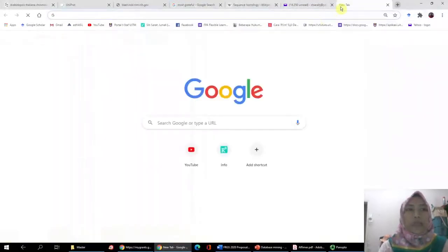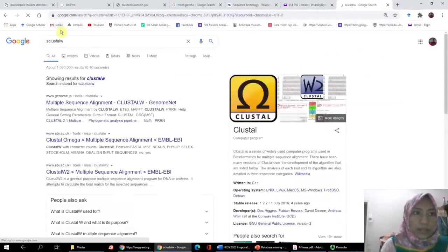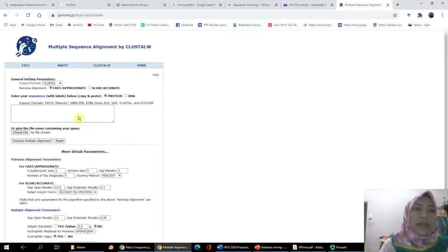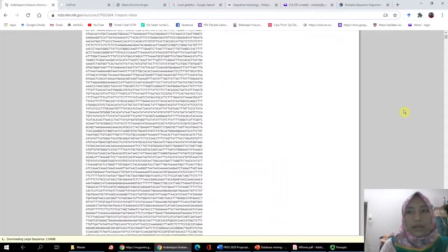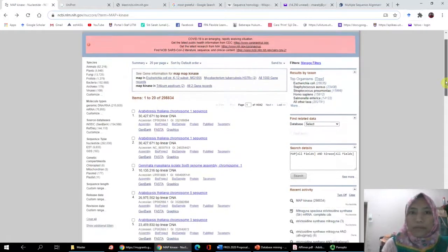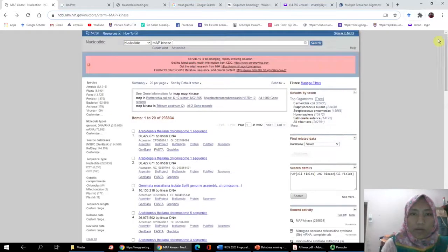And like I said, if you're looking for sequence alignment, there is ClustalW. Sorry, it's ClustalW. This is for multiple sequence alignment. Let's say you take 5 of these and just copy them from this one. Okay, this is too long. I'm going to take smaller ones. Wow, that's too big. Probably need to find some from bacteria. E. coli, maybe. I'll choose one.